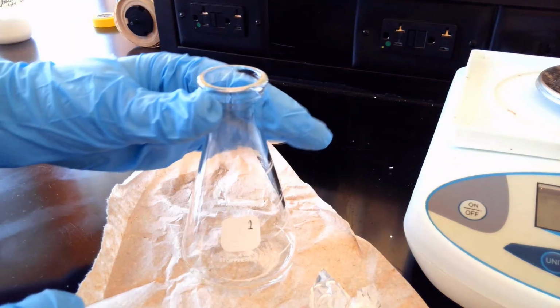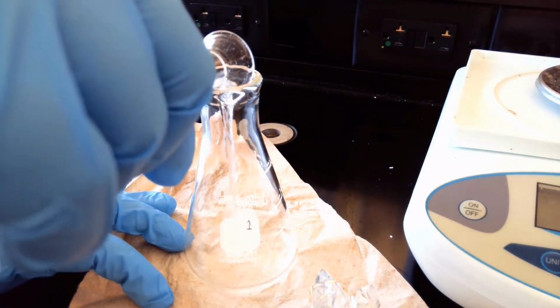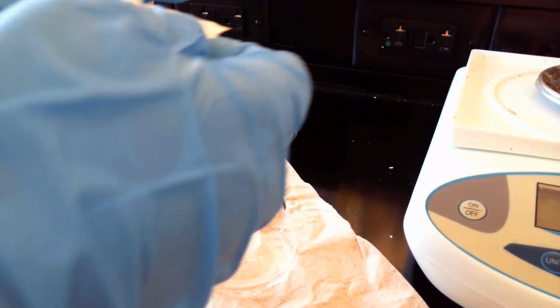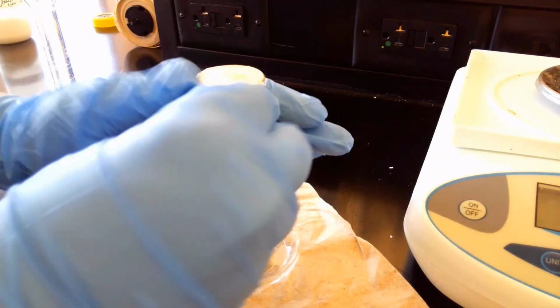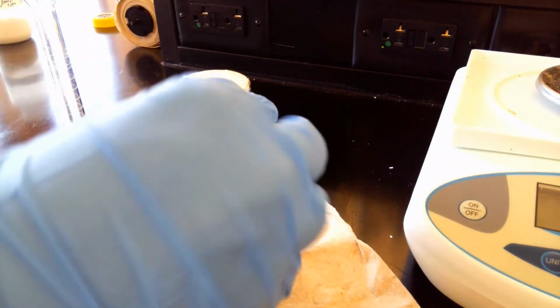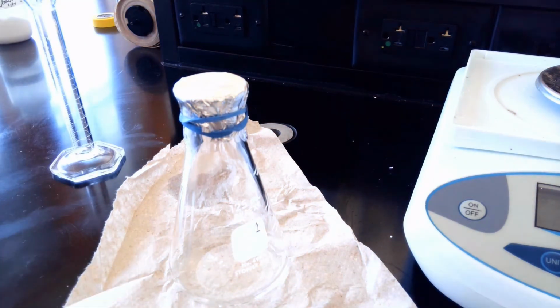Should be good. Here's our new 5 mils going in of our same unknown. I'm going to put the top back on. Make sure it's secured. I'm going to use our rubber band again, going around all those edges. And we're going to put this back in the water bath and do the exact same thing for trial 2.